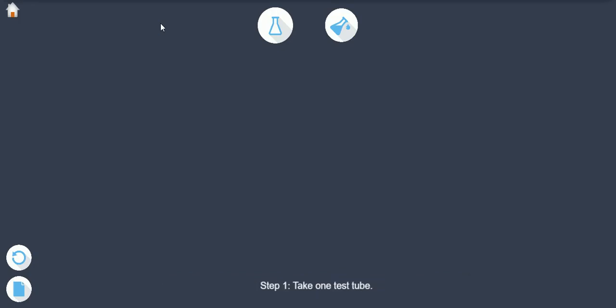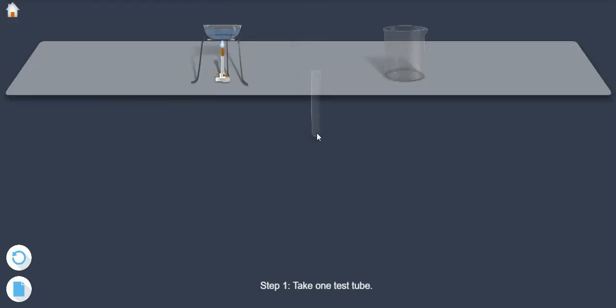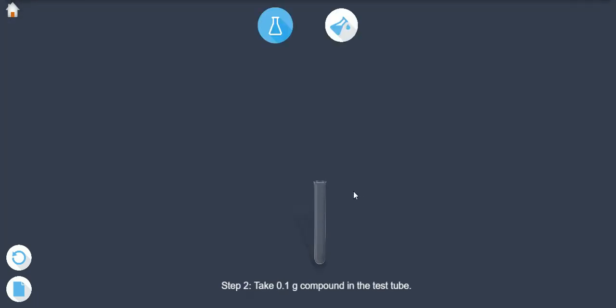Step 1: Take one test tube. Step 2: Take 0.1 gram of the compound in the test tube.